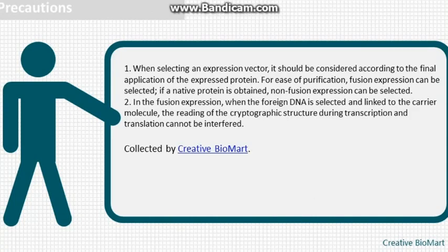Precautions. 1. When selecting an expression vector, it should be considered according to the final application of the expressed protein. For ease of purification, fusion expression can be selected. If a native protein is obtained, non-fusion expression can be selected.